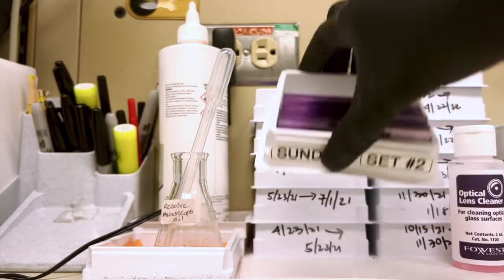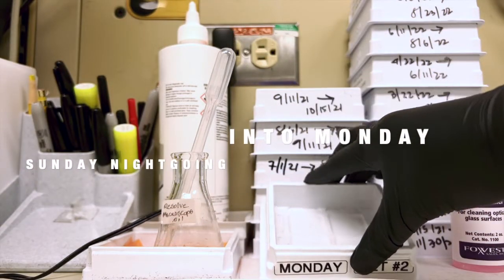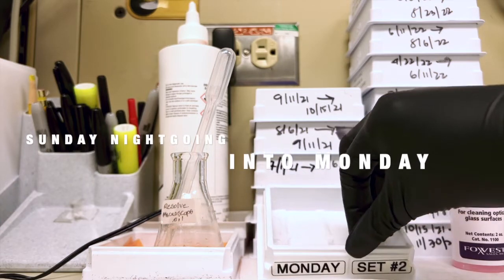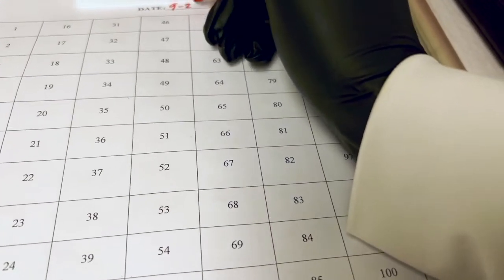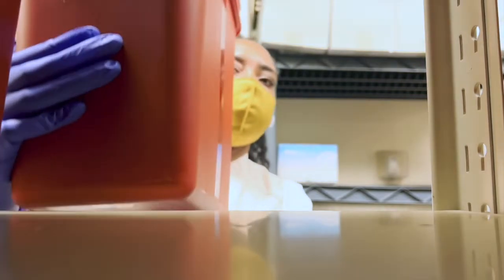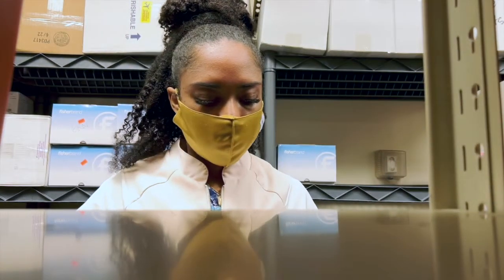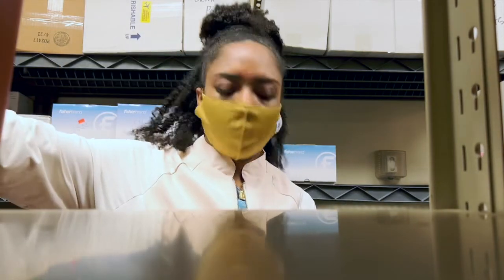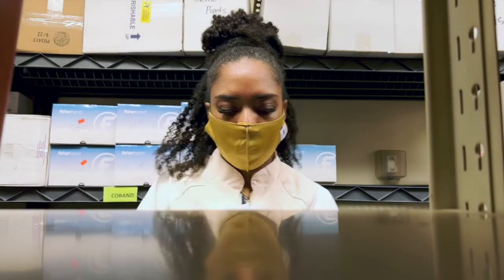Here, I'm switching over the slide boxes to Monday. One thing about working overnight, you'll be responsible for changing the racks, slide boxes, whatever is needed to change over for the next day. Sometimes you'll be responsible for pulling the biohazard bags, changing the sharps, disinfecting all the countertops and phones, etc. But night shift is responsible for switching over to the next day, pretty much.